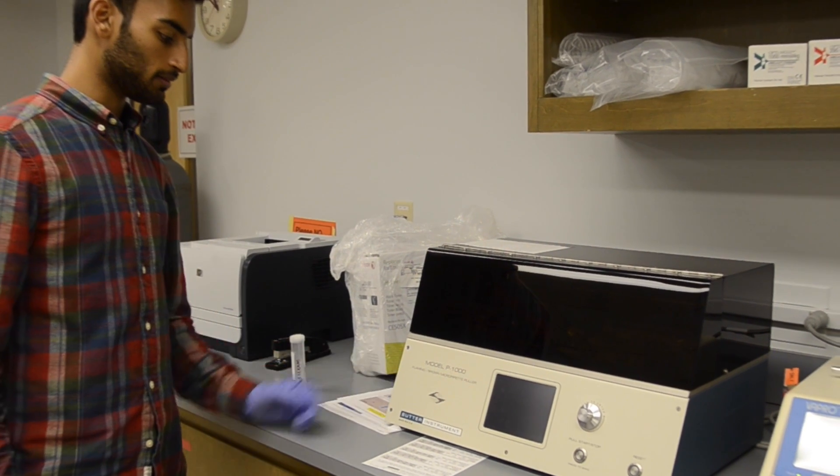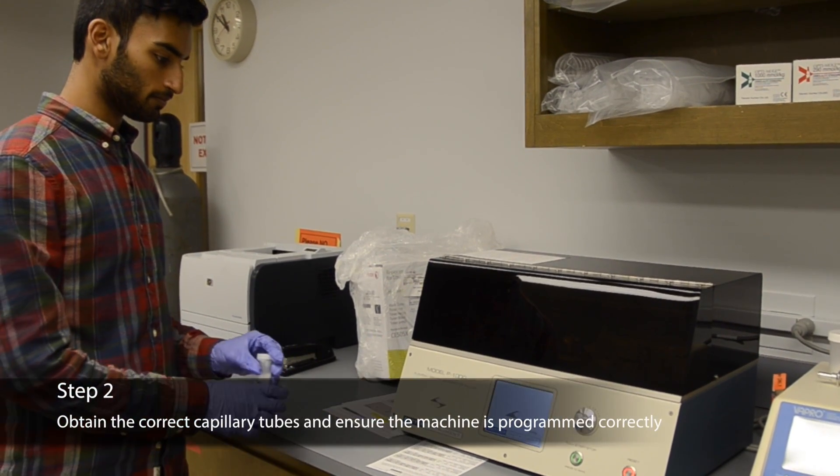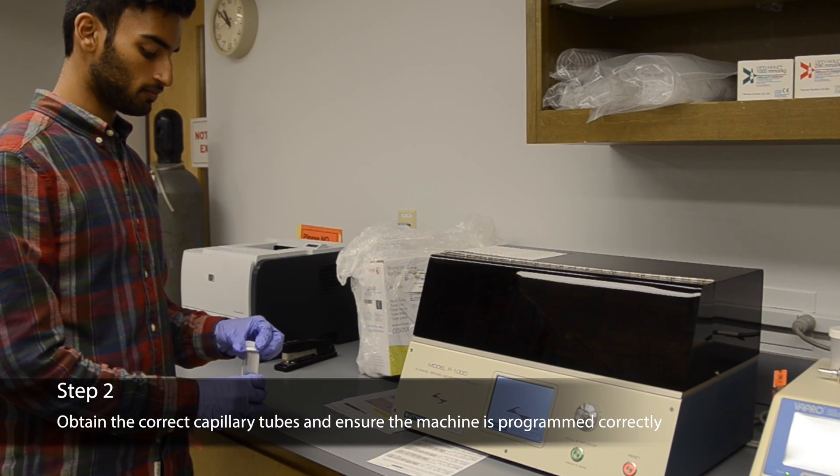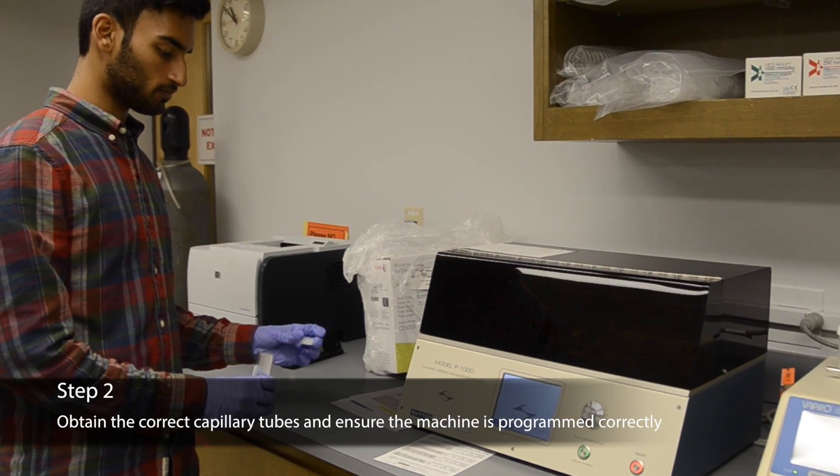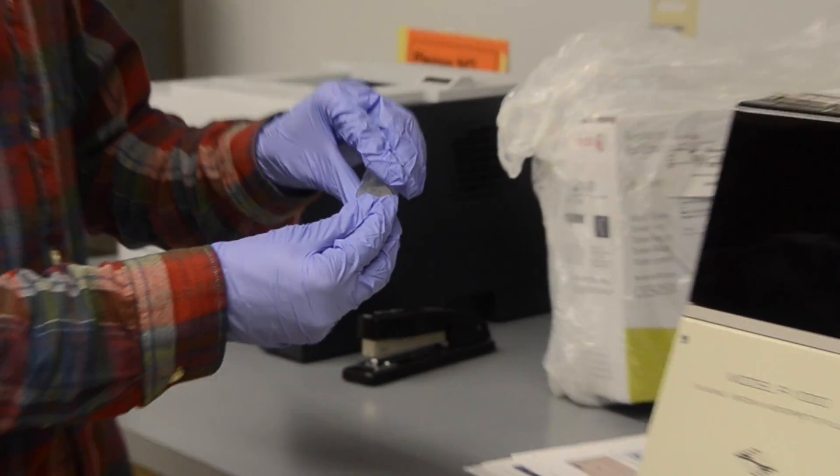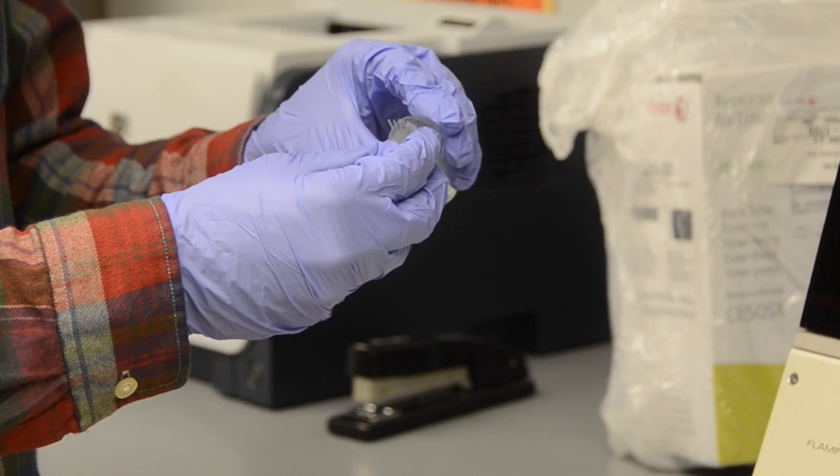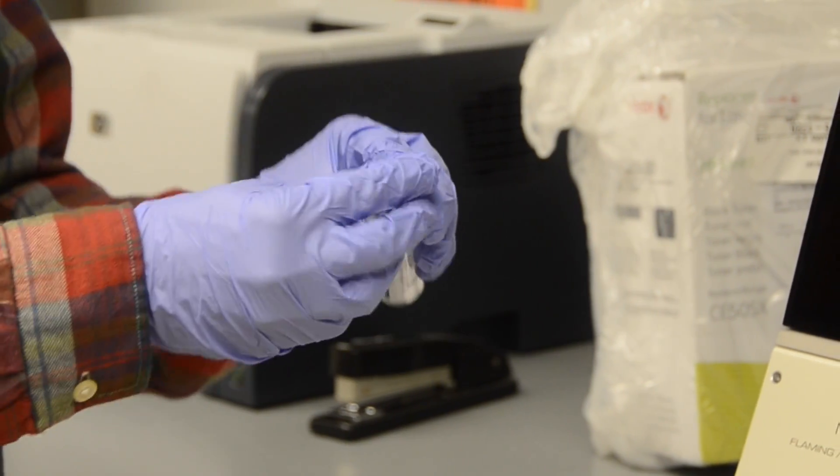Turn on the needle puller. We use thin-walled world-precision capillary glass tubes to pull needles. They are filamentous, 4 inches long, are 1 millimeter in outer diameter and 0.75 millimeters in inner diameter.